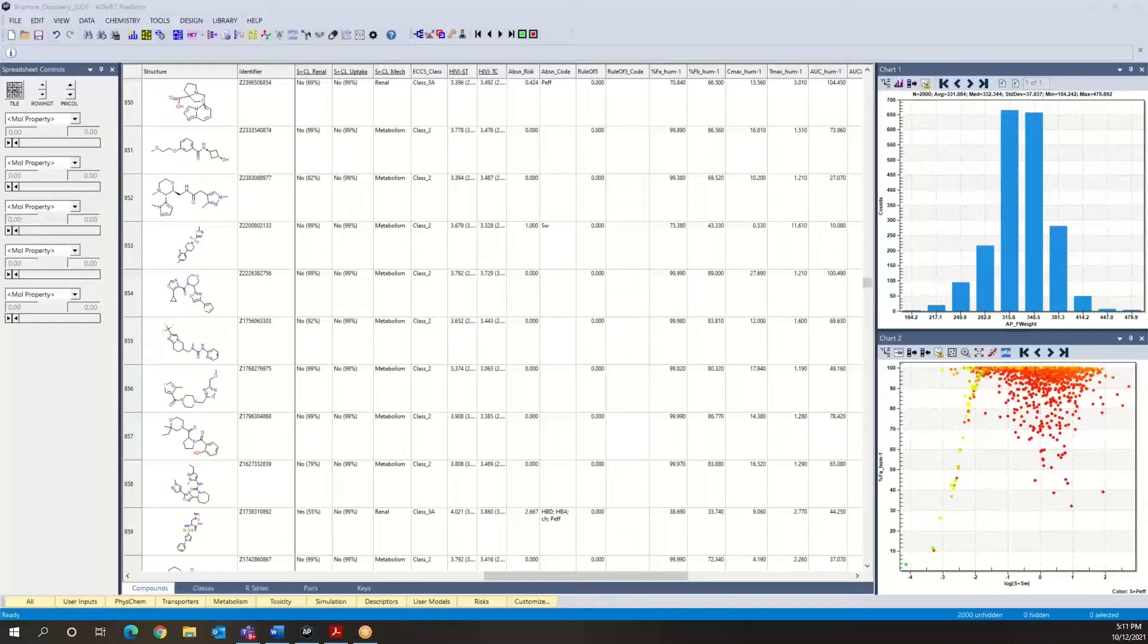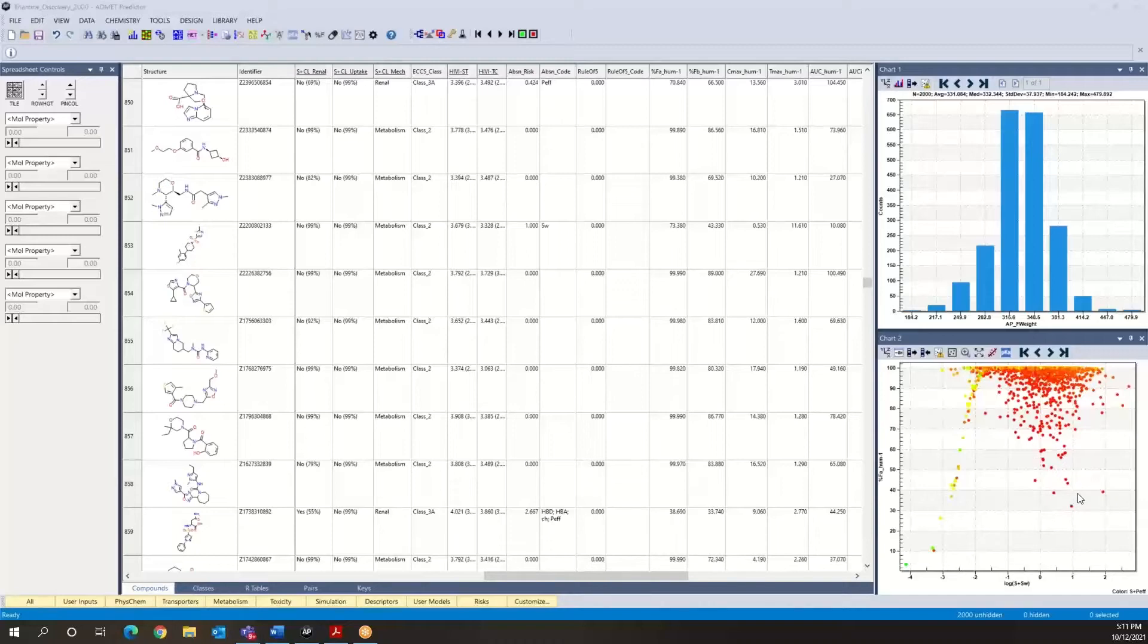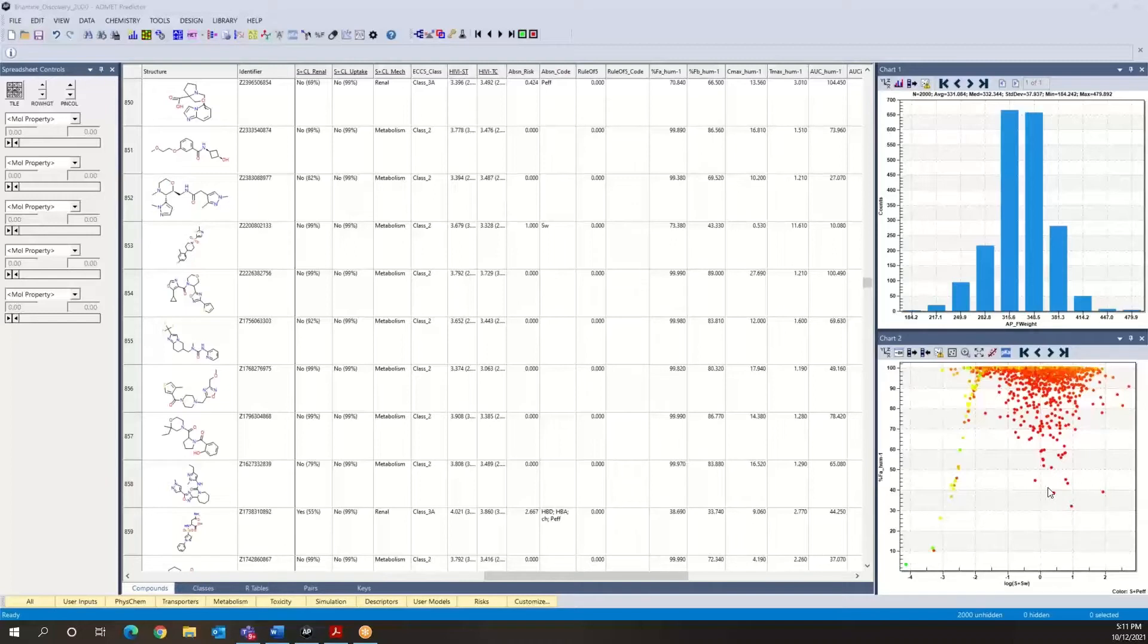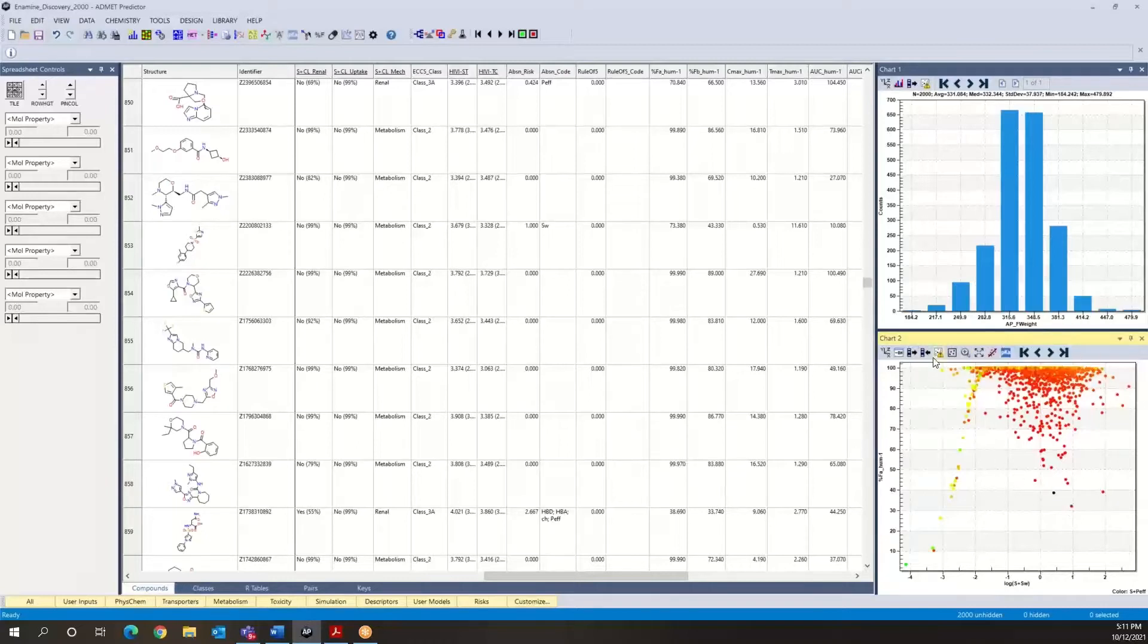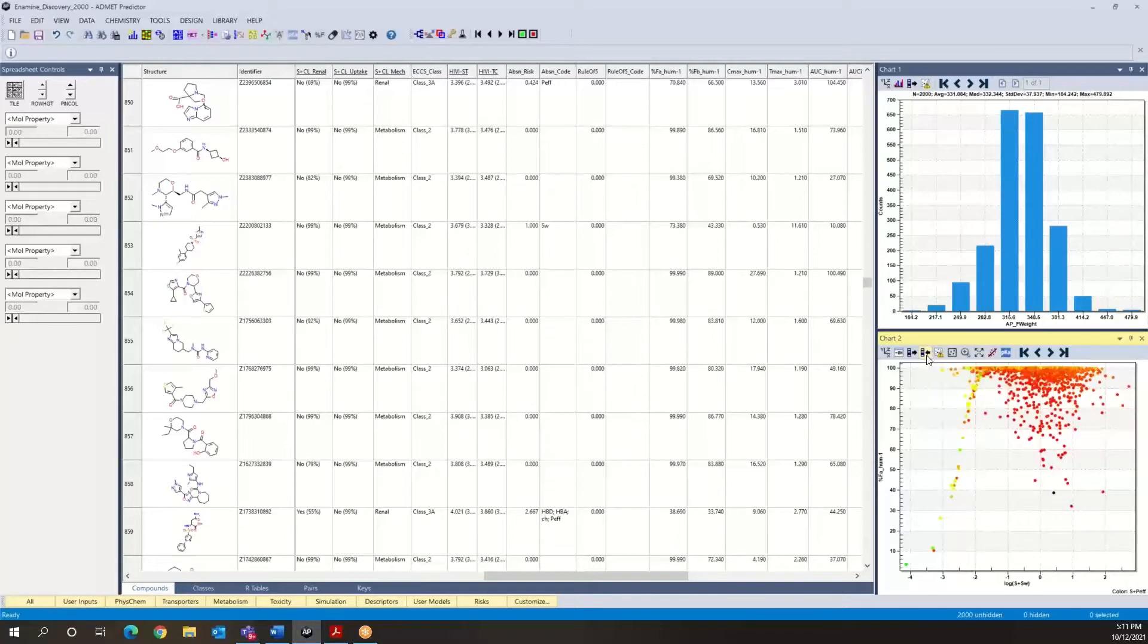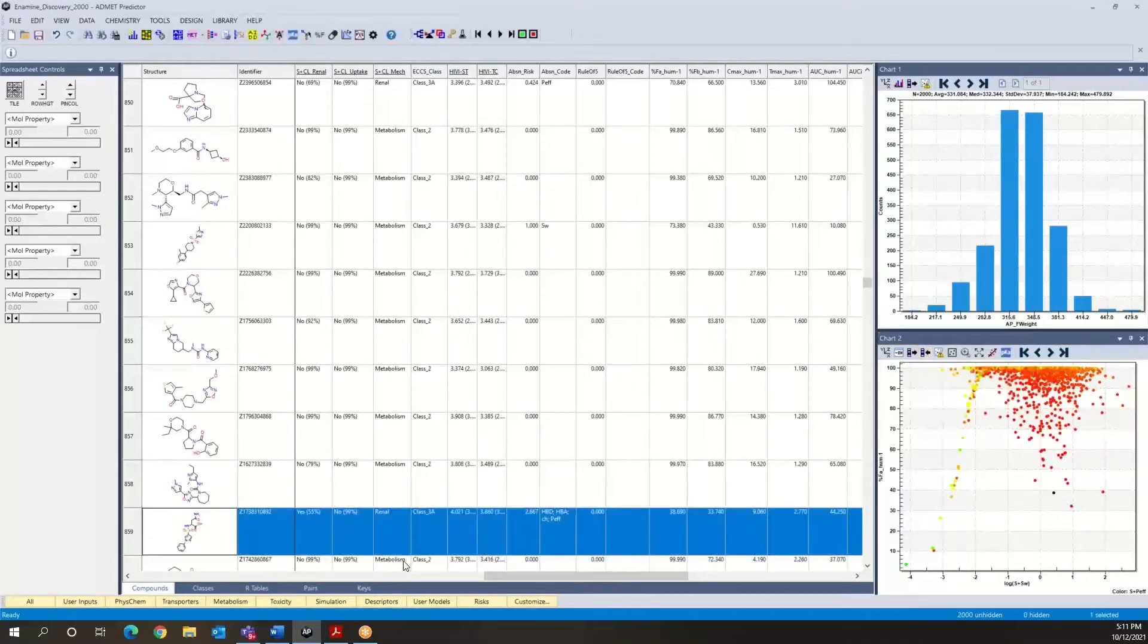As we've seen before in this graph, we suspect that these compounds in this particular area are most likely permeability-limited compounds. So we can investigate that at a higher level of depth using our parameter sensitivity analysis tool. The way we would do this is, for example, select this compound and then use this button over here to update the spreadsheet, and we can see which compound that is.